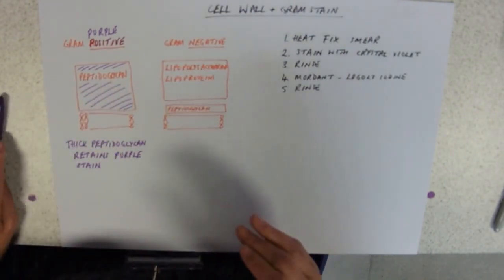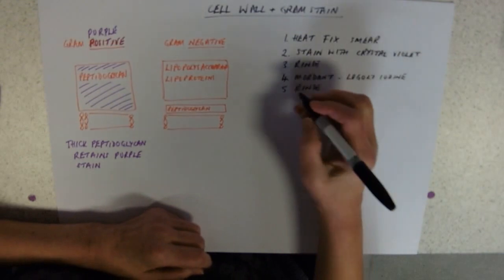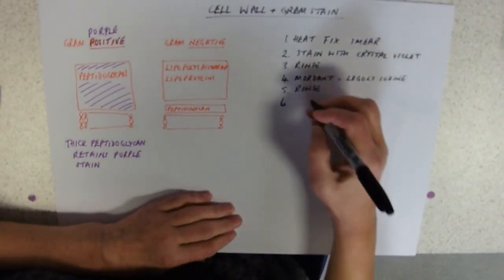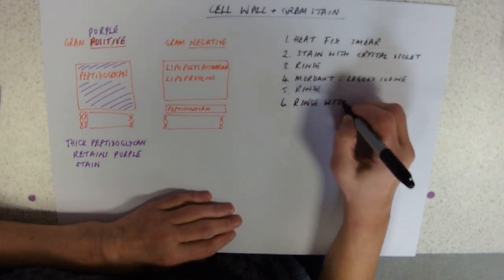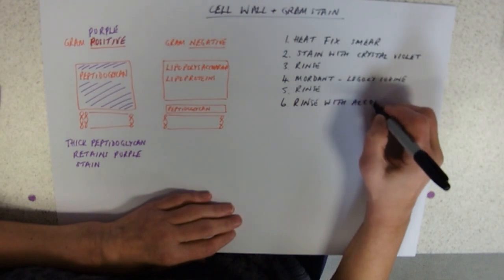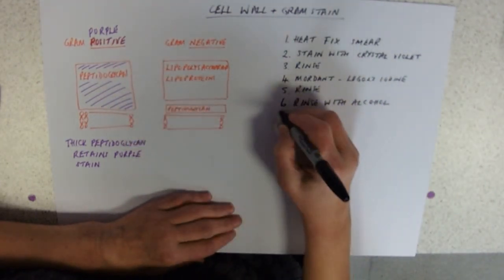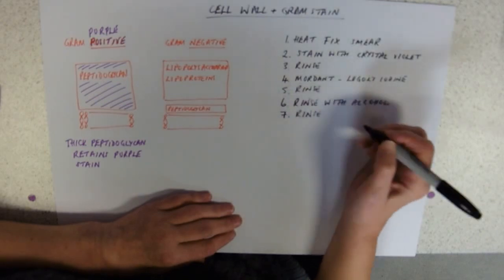The next thing is to do a counter staining procedure. First of all, you need to get rid of all the purple, so you rinse with alcohol. Now you've got to be quick with that, because alcohol will also take out the purple stain and you'd get a false gram negative. So you're going to rinse again with water.